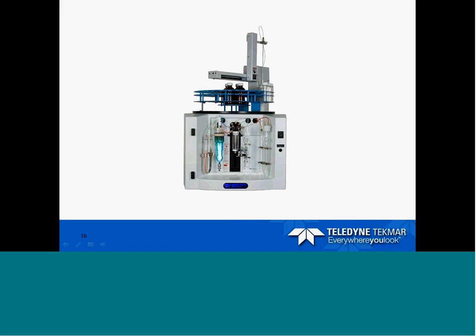It is a syringe and valve mechanism so that we are able to do automatic dilutions within the system. And it has a volume delivery range of 125 microliters all the way up to 25 ml.